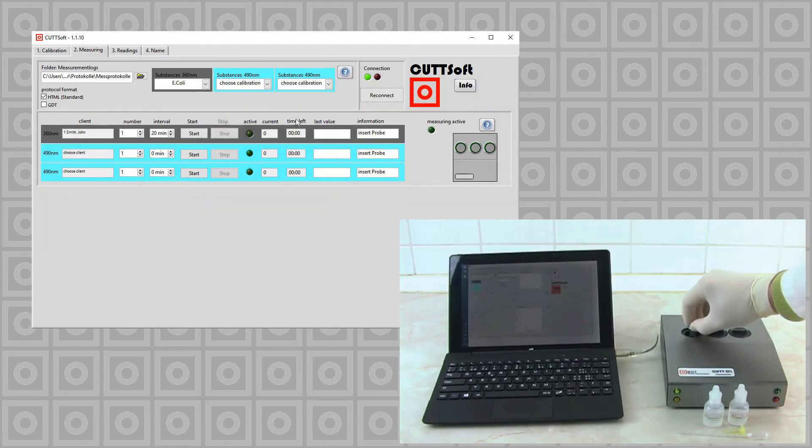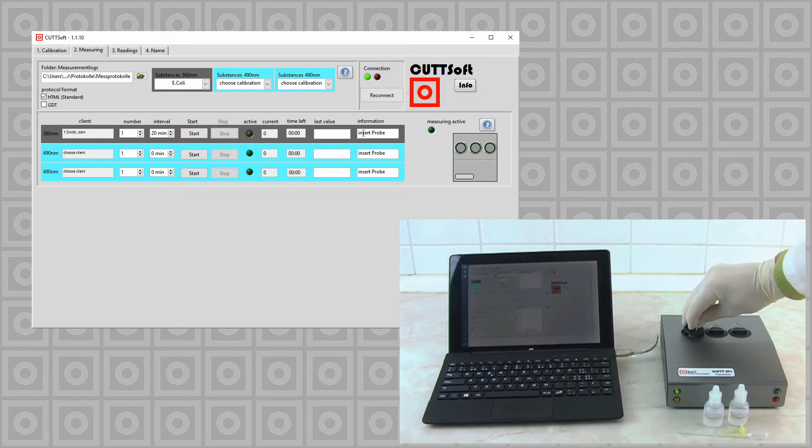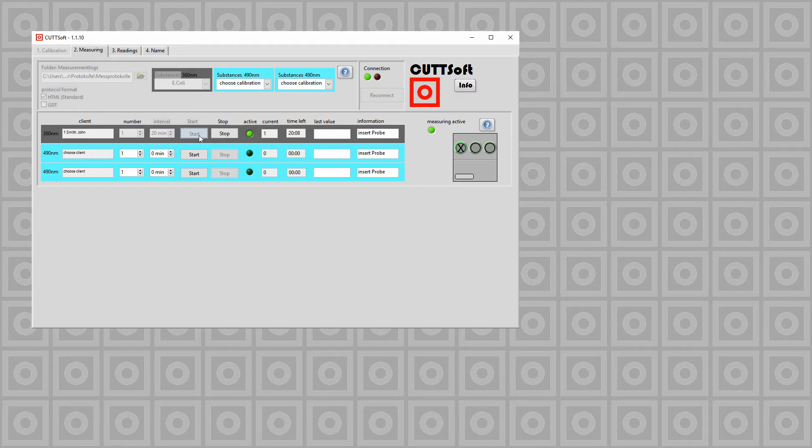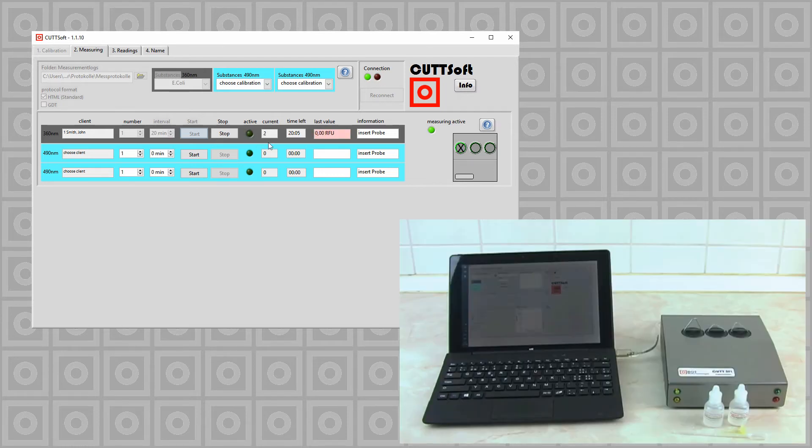Next we have to insert our probe and click on start. The blank volume was measured.